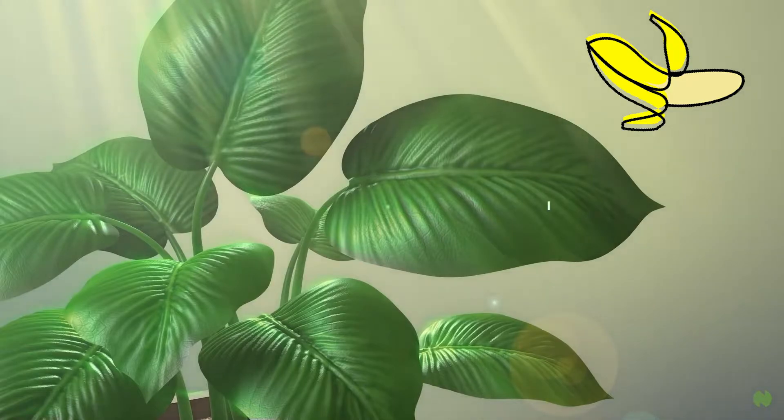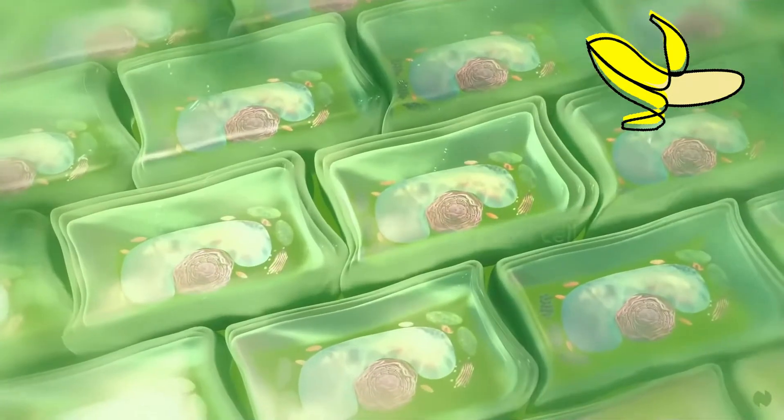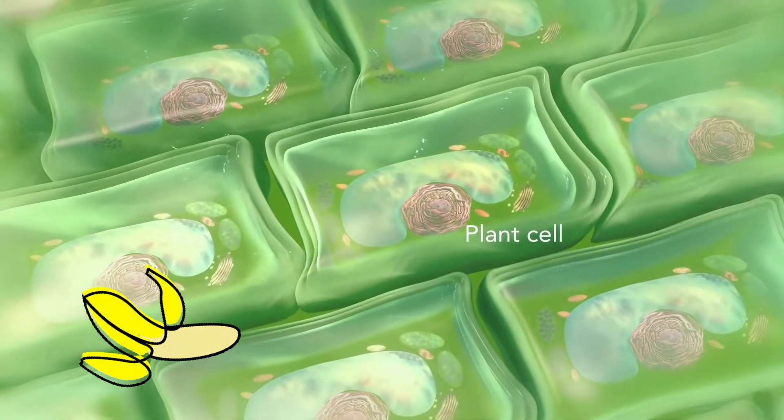Bananas are plants, which makes them a eukaryote, so in this lab we are extracting DNA out of the nucleus.